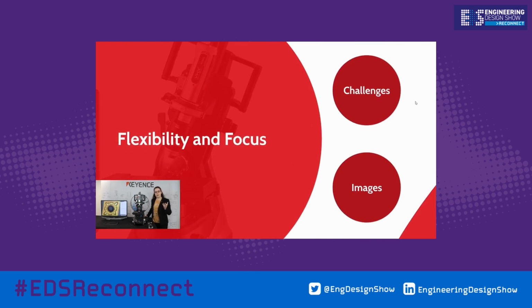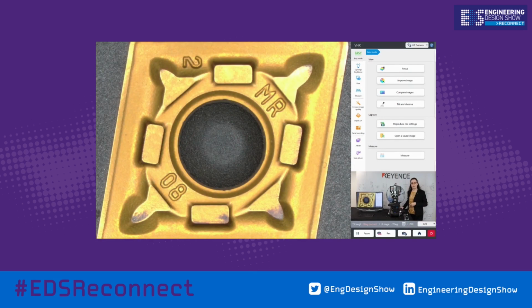So I'm going to show you how this works on the VHX. If I move to our microscope here, we've got a gold cutting tool on the sample. And you can see, gold cutting tool on the stage even.